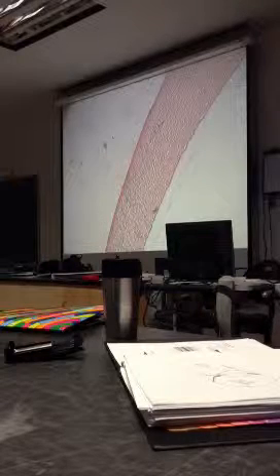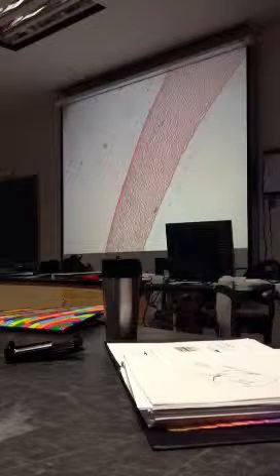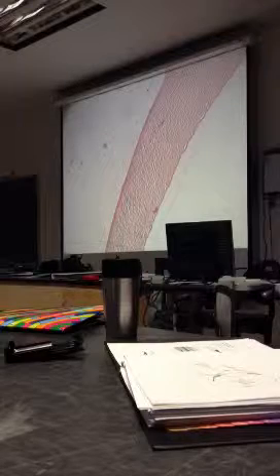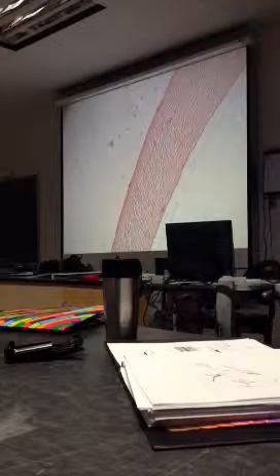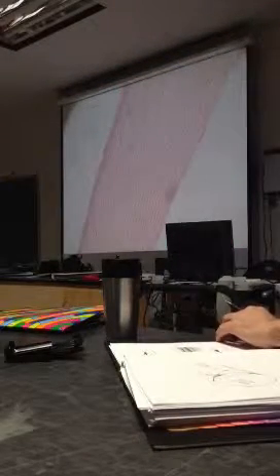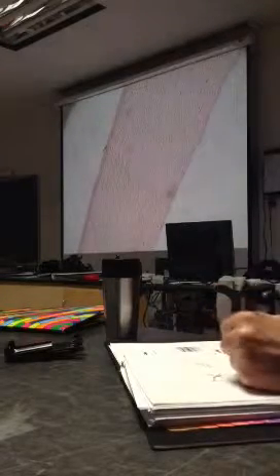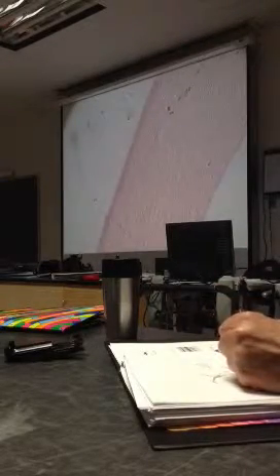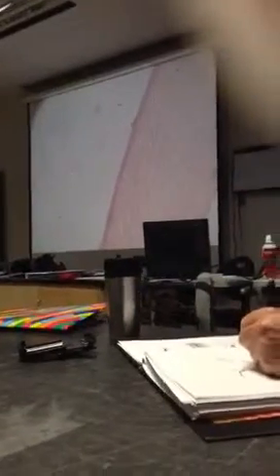We should be able to zoom in out here and see what layer covers the anterior part of the eye and goes up under the eyelid. What's on the anterior part of the eyelid? The ocular conjunctiva — yes, the ocular conjunctiva. I could get even more close, but it's a non-keratinized stratified squamous epithelium. There's your ocular conjunctiva.